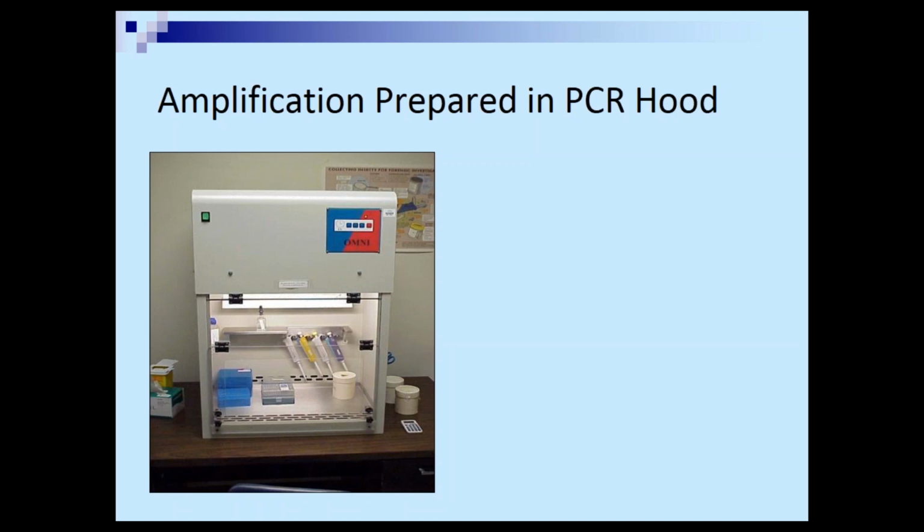How do you do that? Take 352. I mean, you put a little bit of your DNA, and these are the tubes. These are pipettes. So this is what you suck up a little bit of liquid with, and you inject a little bit of liquid with. All right. So you put a little bit of DNA.